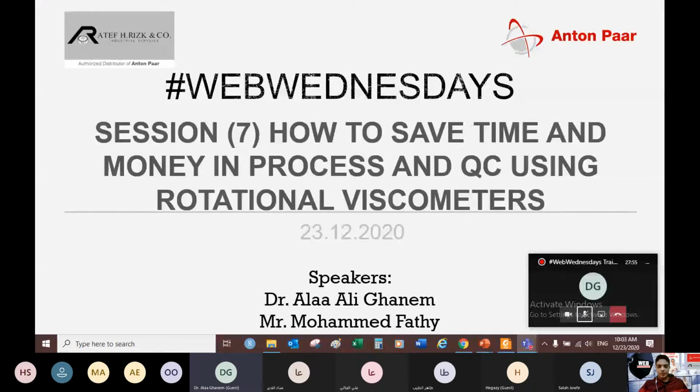Today's session we will talk about the viscometers and how to measure viscosity, and about the types of viscometers and their application, especially in the petroleum fields.